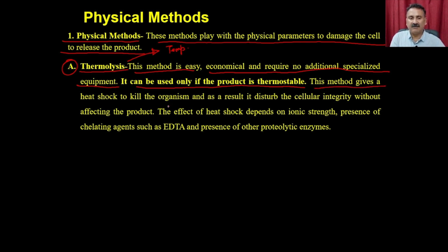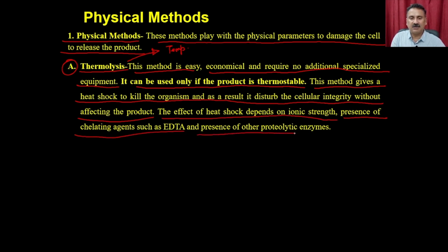This method gives a heat shock to kill the organism, and as a result it disturbs the cellular integrity without affecting the product. The effect of heat shock depends on the ionic strength, the presence of chelating agents such as EDTA, and the presence of other proteolytic enzymes.